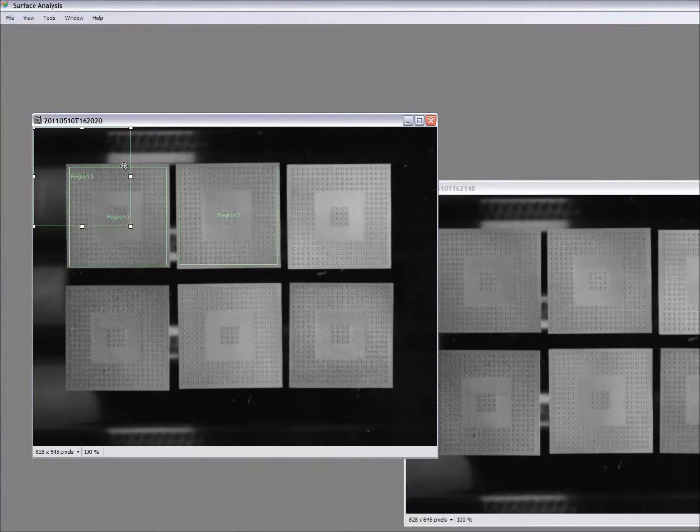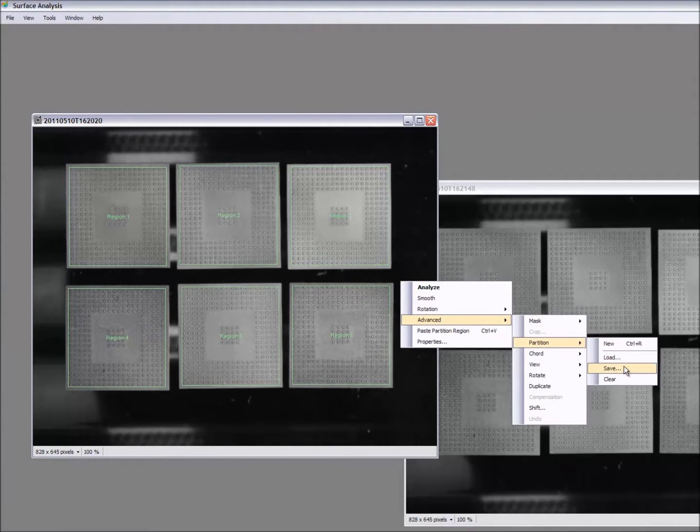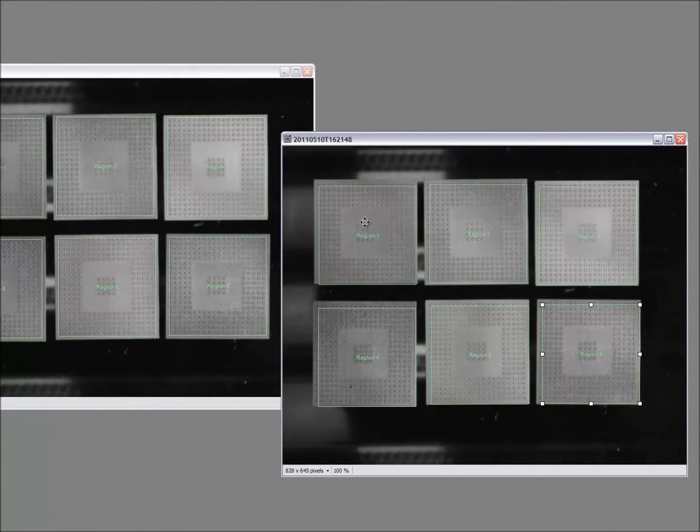Once a thermal run is completed, part locations are partitioned individually in the software. Ideally, the samples will not move during the thermal run, but realistically, this is rarely the case. When samples do move, then the user must either spend significant extra time in partitioning each image individually or accept that the chosen region of interest may likely vary over the temperature profile. Either way, the ability to partition a consistent region of interest can be a concern.